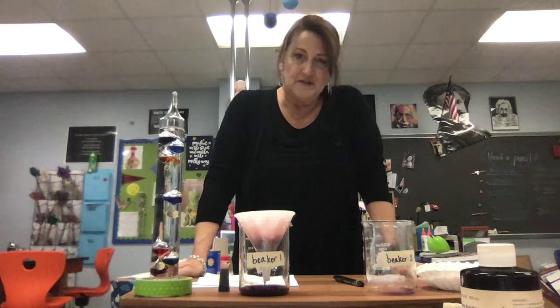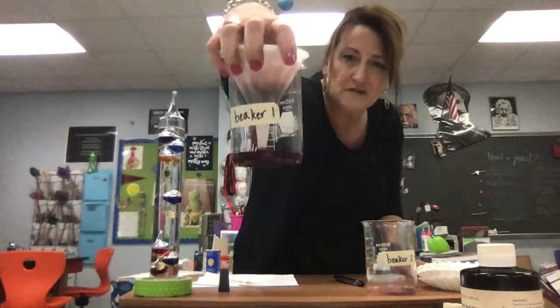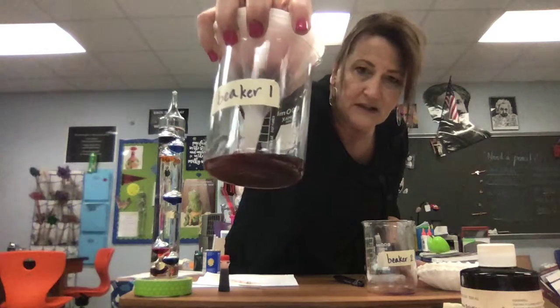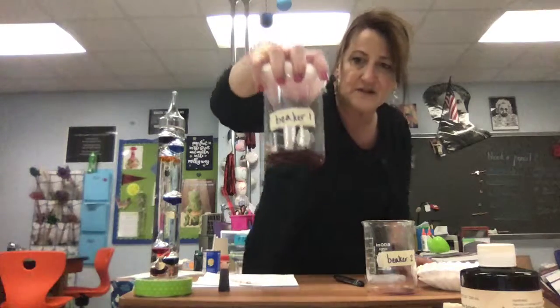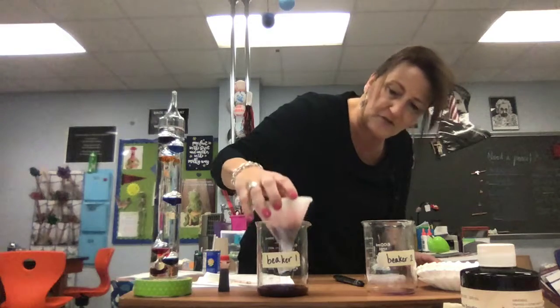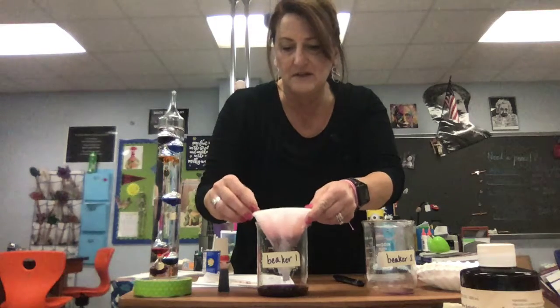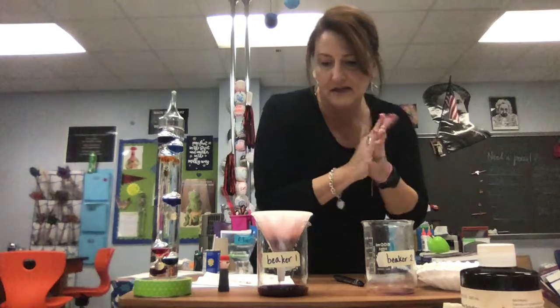So what changes are you noticing? So let's see if we can get it up close. Maybe it's hard to see in the camera, but this is much less murky. It's much clearer, okay, than it was initially. It also has much more of a red to it than it was before, okay? And this is almost done filtering because I want you to see what it looks like after.